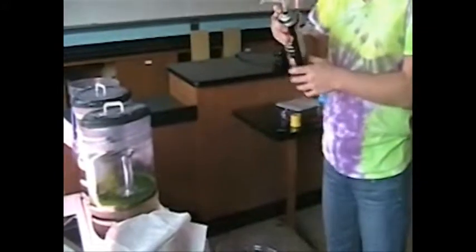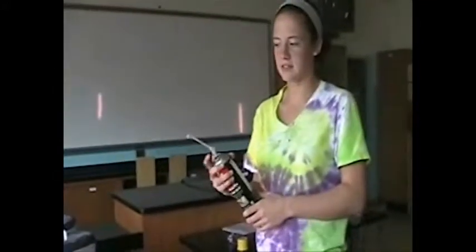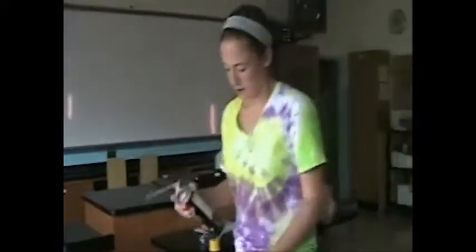So you're going to take this, and you don't want to do too much, and you have to be careful because this comes out really fast. You want to do all of your containers at generally the same time because this dries so quickly. So right now I'm going to do it kind of quick, try to avoid getting it on the brass part, and swirl it around gently.